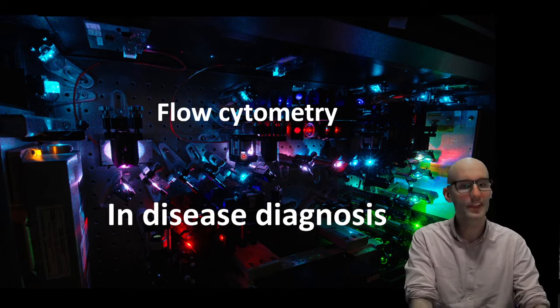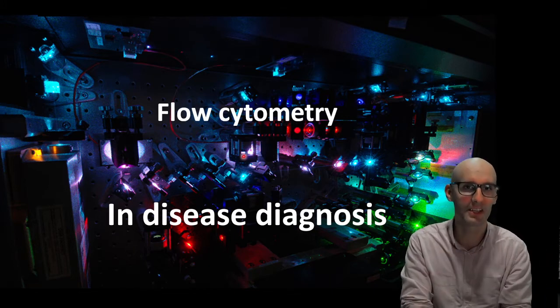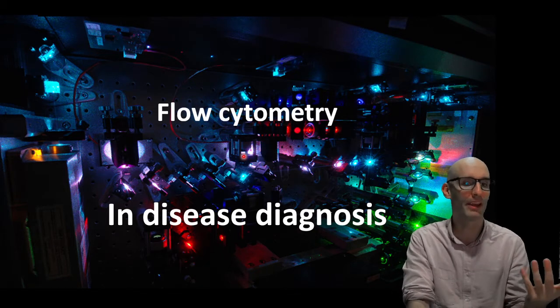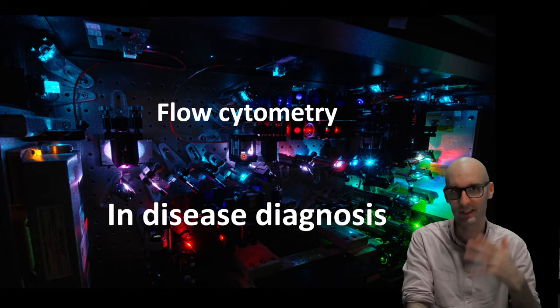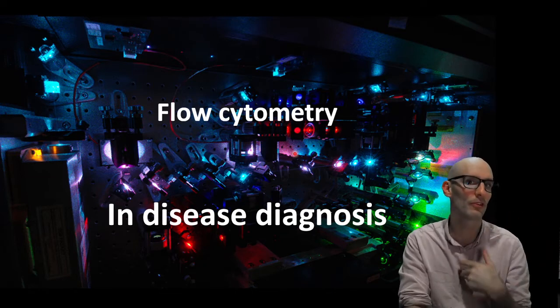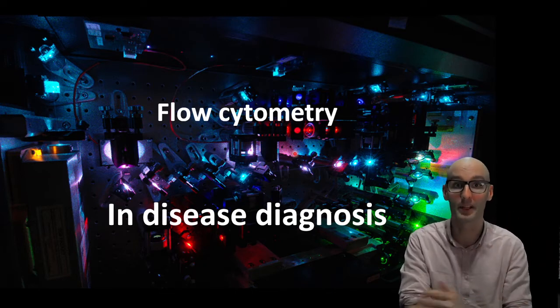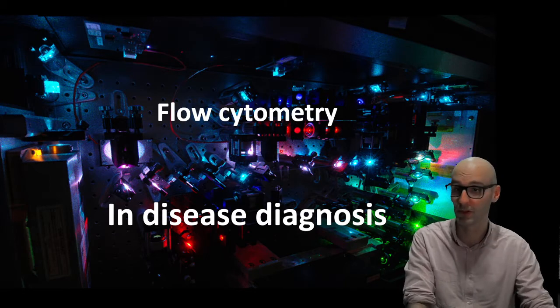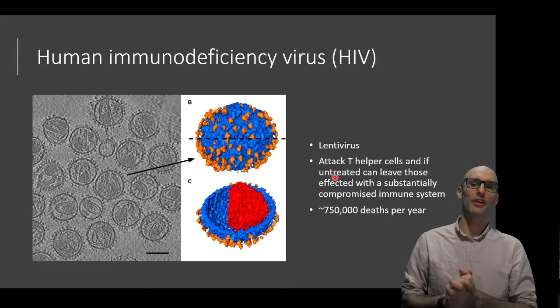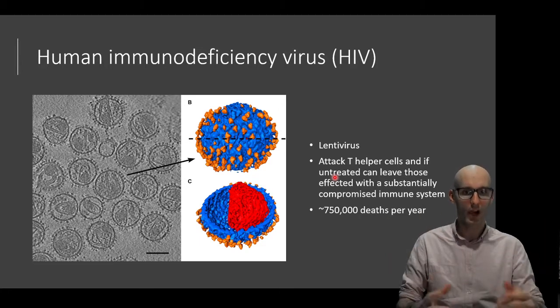And it's for this reason that it's often in the basement of most hospitals, you'll find a flow cytometry machine, as well as pathology departments and places here. They use flow cytometry because it is essential for evaluating things like immune cell populations, particularly peripheral immune cells. So the disease we're going to cover is HIV, human immunodeficiency virus.